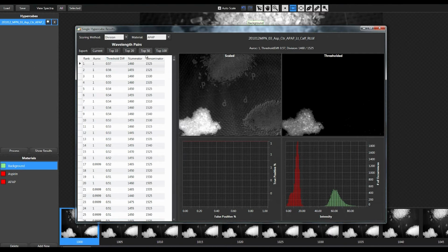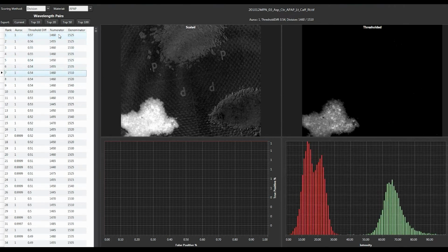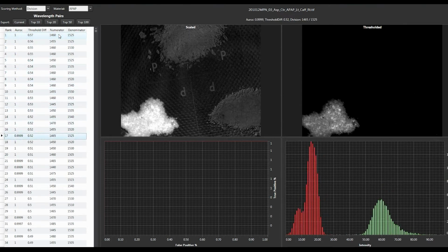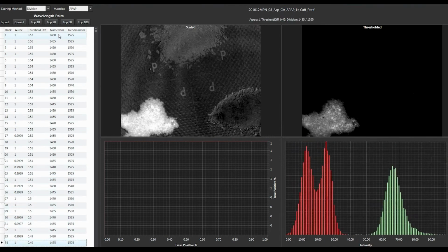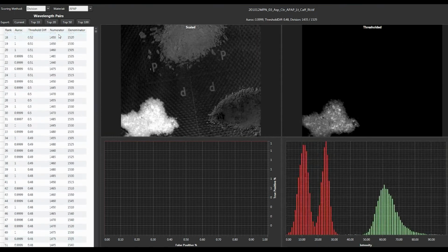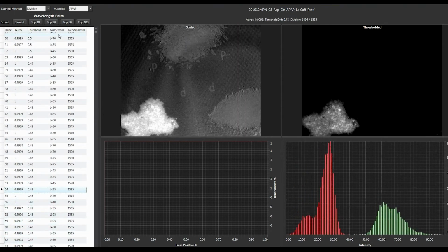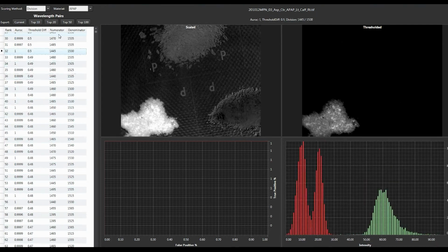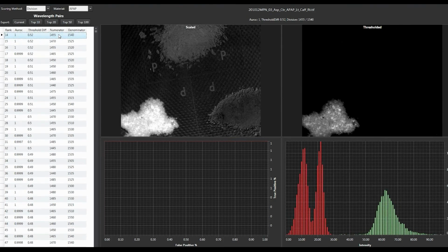Using advanced proprietary algorithms, it chooses the best wavelengths for target identification. On the intensity graph shown, the greater the separation between the red target histogram and the green background histogram, the easier it is to identify the target, indicating a better recipe. This process is completed for all 3 active ingredients of the Excedrin tablet: acetaminophen, aspirin, and caffeine.